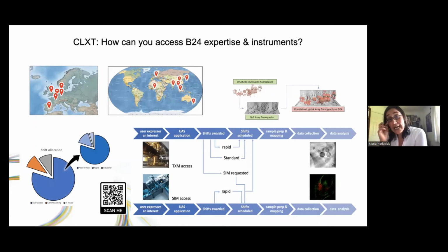What we have done to try to overcome this, and we're now running pilots with the MRC Mouse Institute, is take tissue samples, disperse the cells, allow them to settle, and then examine the populations. It's a pseudo tissue, it's not 100%. At the same time, we're developing biomatrices, so they have the 3D option, but it's still a work in progress.